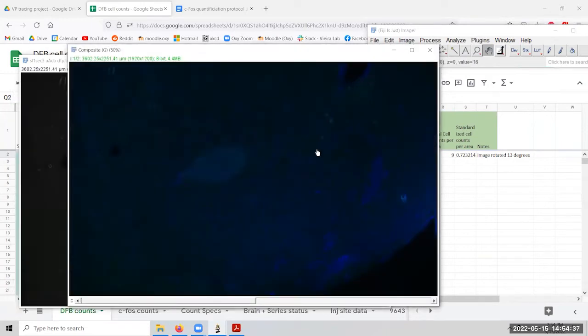And in order to get the counter stain to pop out, you can color adjust the counter stain. You don't want to color adjust or amp up the coloring of the target because then it can falsely inflate or skew the data. So we definitely do not want to do that. We have the thresholding process for doing that instead. So not screwing up the data, but we have the thresholding process for basically getting the stained elements to pop out and then the non-stained or the background stained elements to be dropped, as you'll see in a bit.